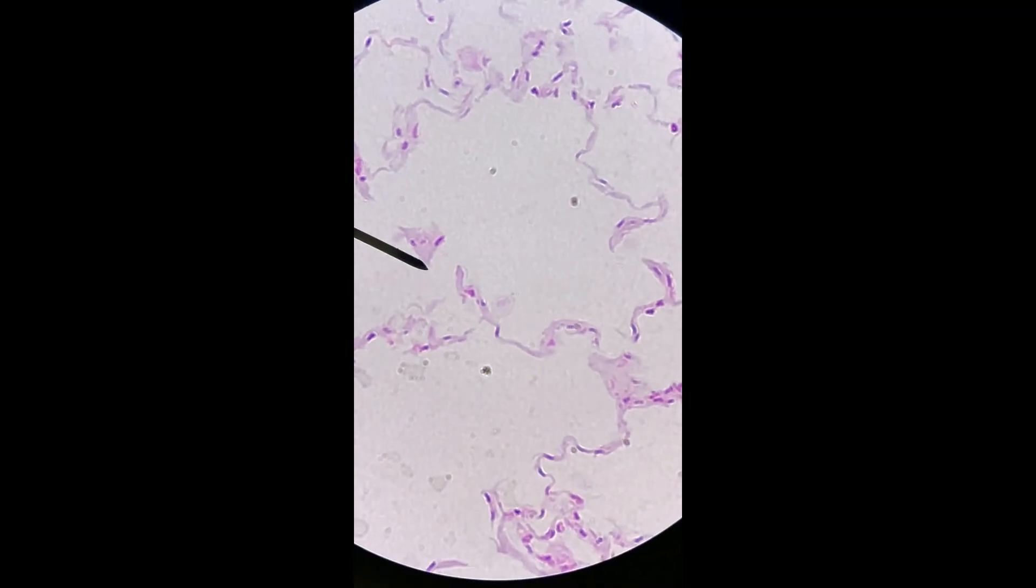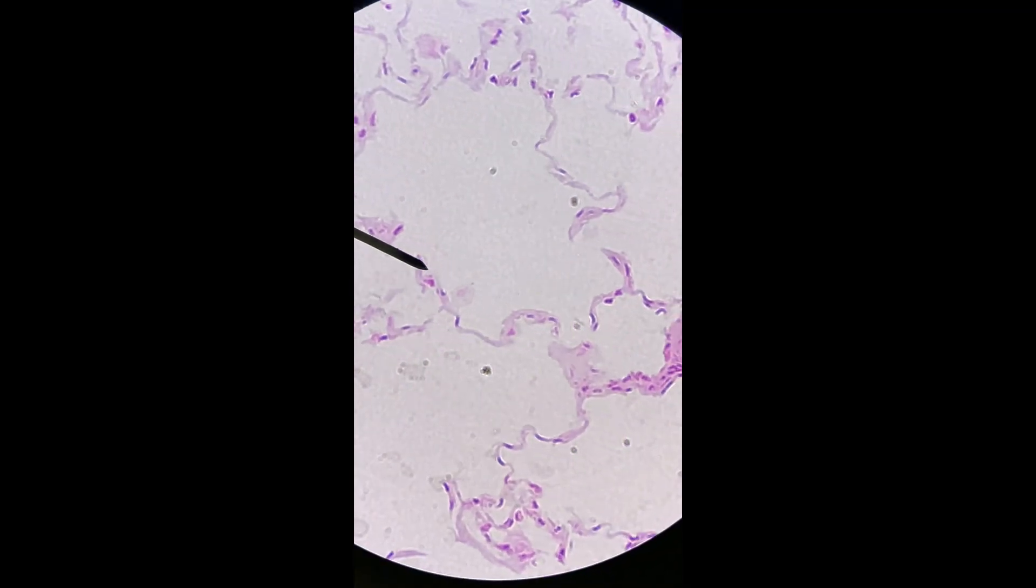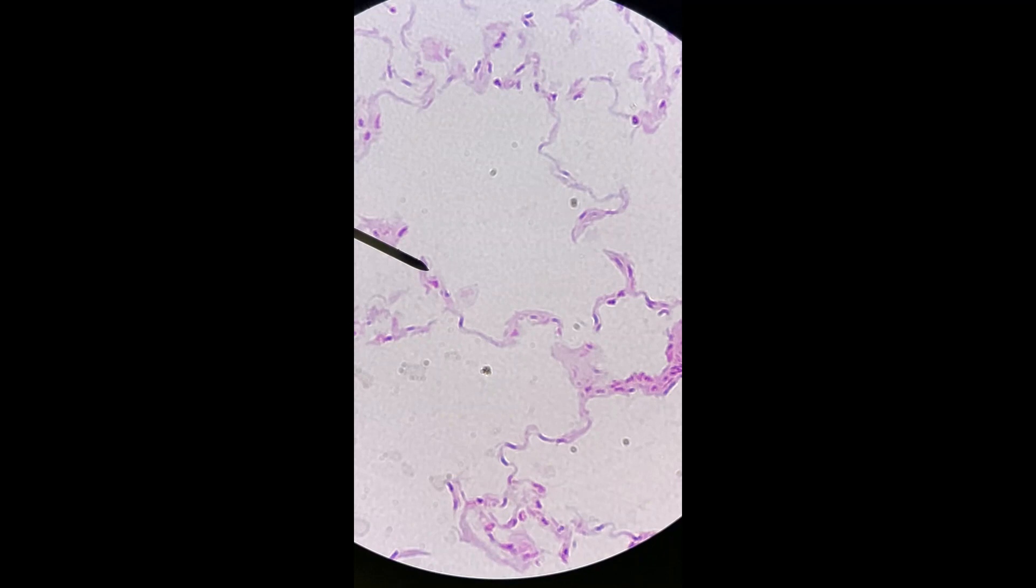And these cells right here that line it, where the pointer is, those are the simple squamous cells that make up the wall of that sac. So they're really thin. They allow oxygen to go across very easily.